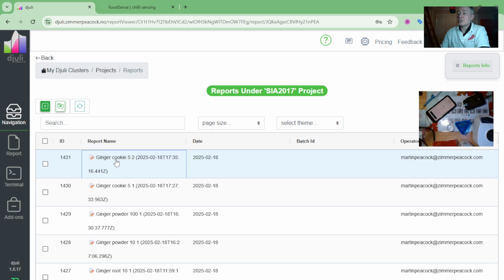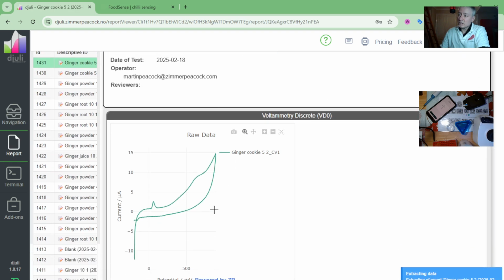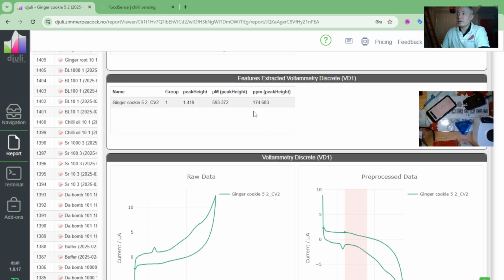But the ginger cookie itself, we did a 1 in 5 dilution. You can just about see what we call peak 1. There's a little wave here, peak 2, and then peak 3. It's a very small little wave, and therefore it only translates to about 175 ppm.